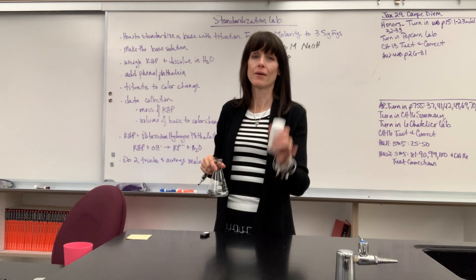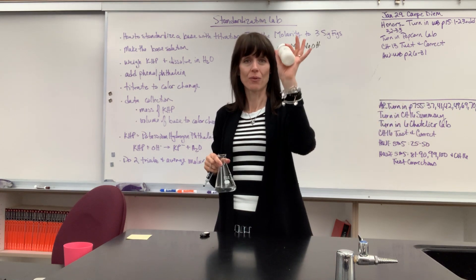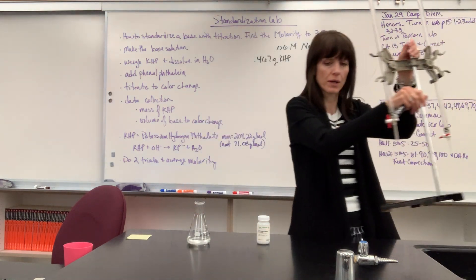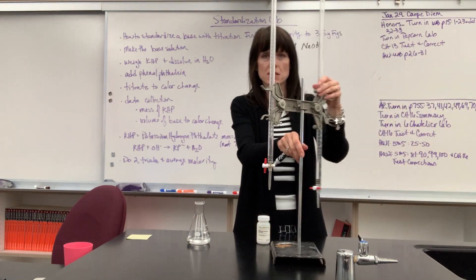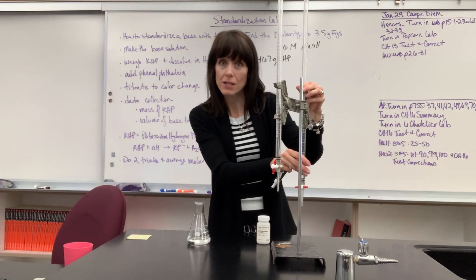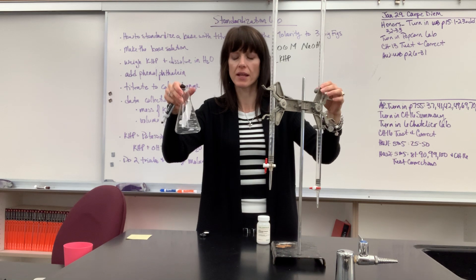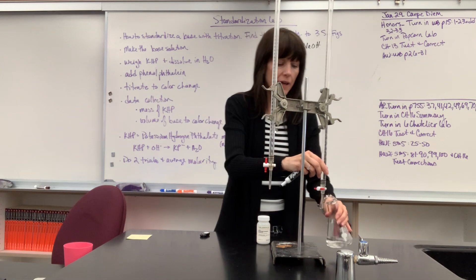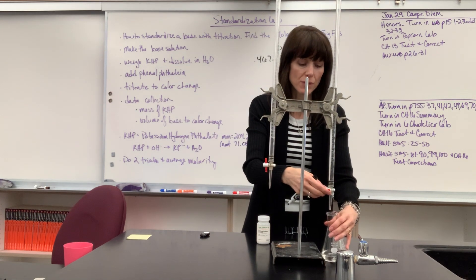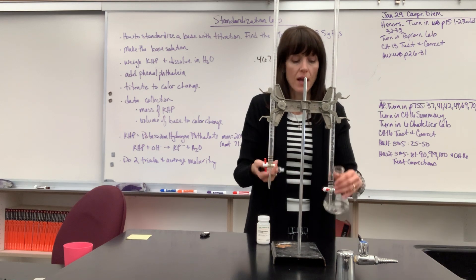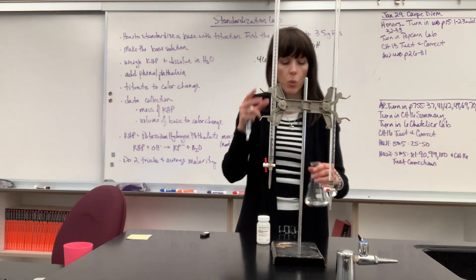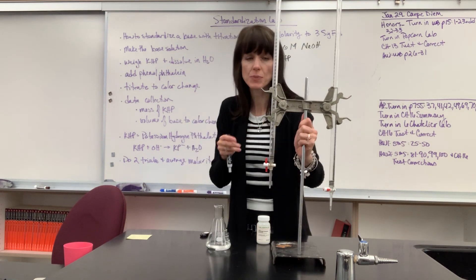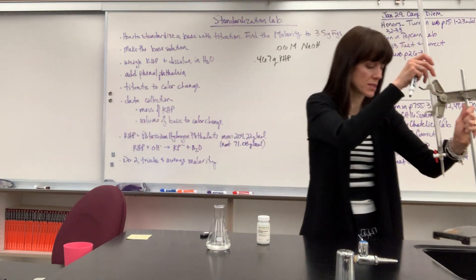Let me review. I made my solution, weighed out my KHP, dissolved it in water, added phenolphthalein, and I titrate. Let me show you this quickly. Here I have my base — I made my 0.06 molar solution. I have my phenolphthalein, and I have my KHP dissolved in here. I just start titrating: drop, drop, drop, swirl, drop, swirl — it starts flashing pink. Slow down. I add one drop — boom, it turns pink. And I read the final volume.